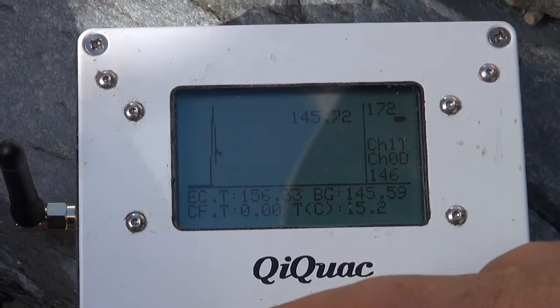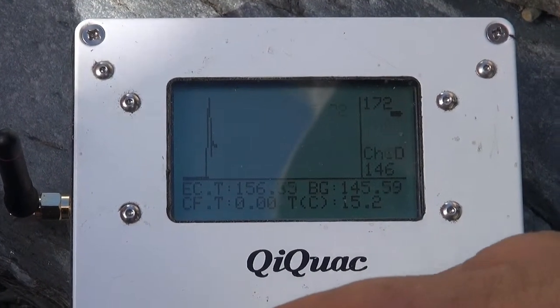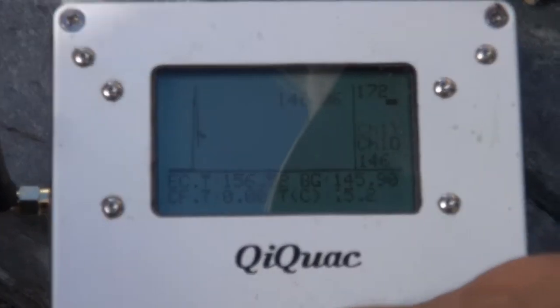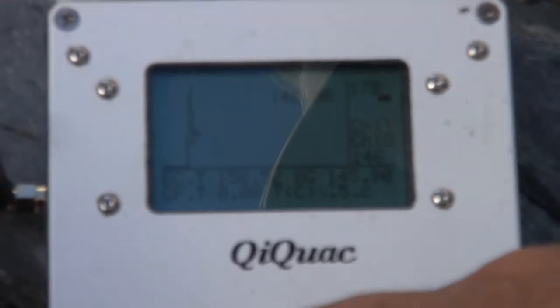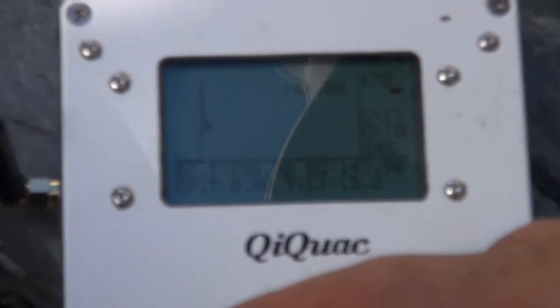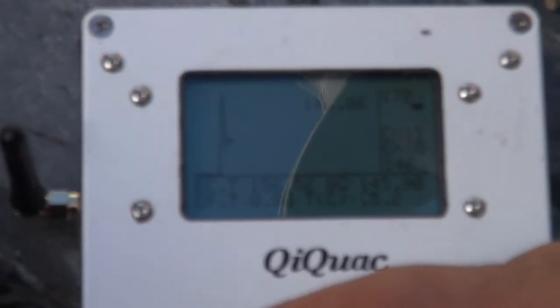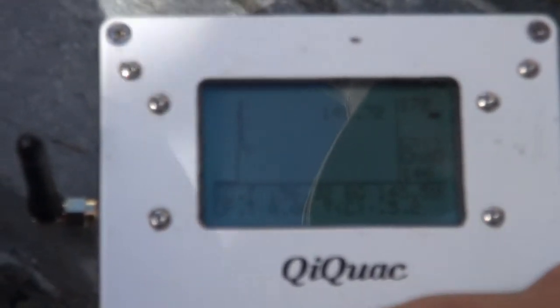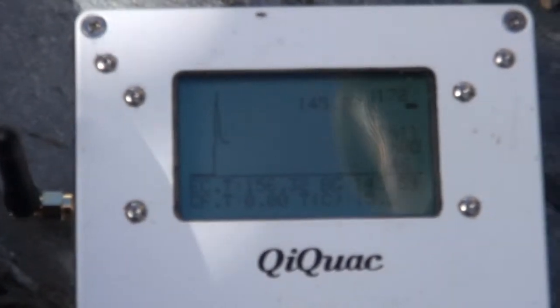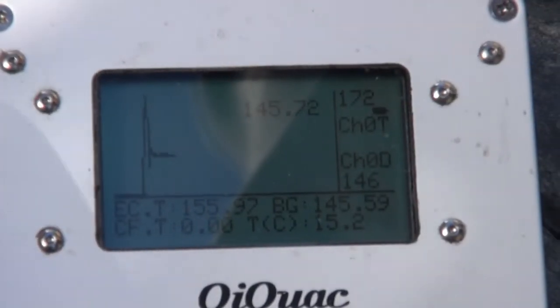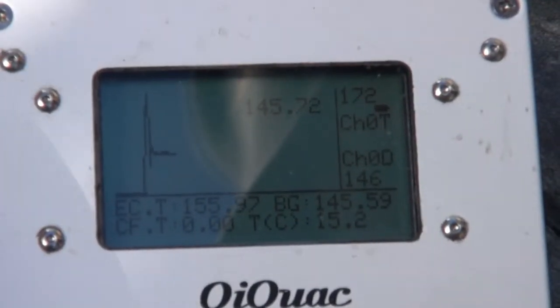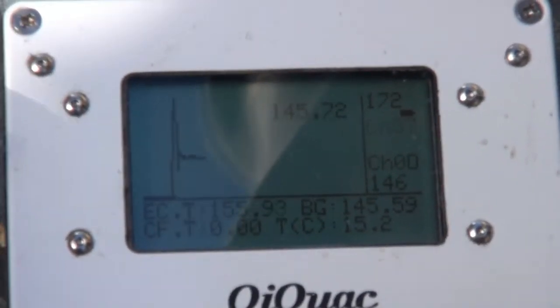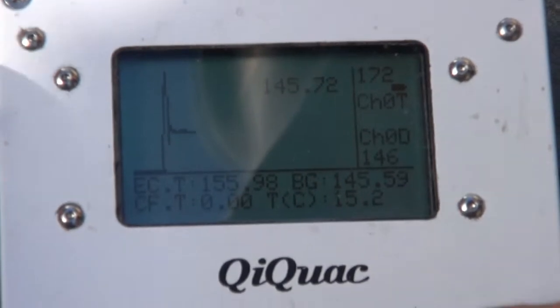156.33, 156.52, so it's spiked up just because it wasn't stirred, and now it's settled down. It's pretty close to that, we'll accept that, so we just press the button.